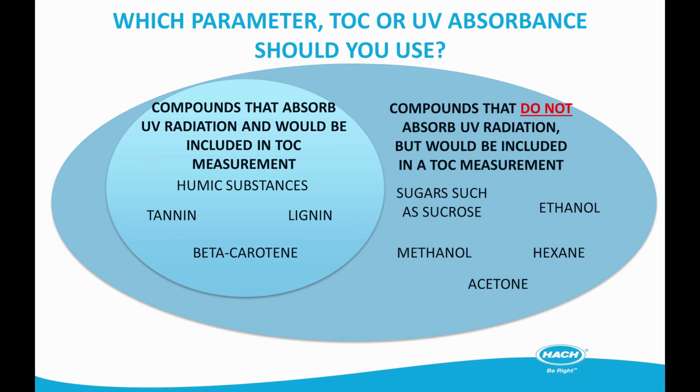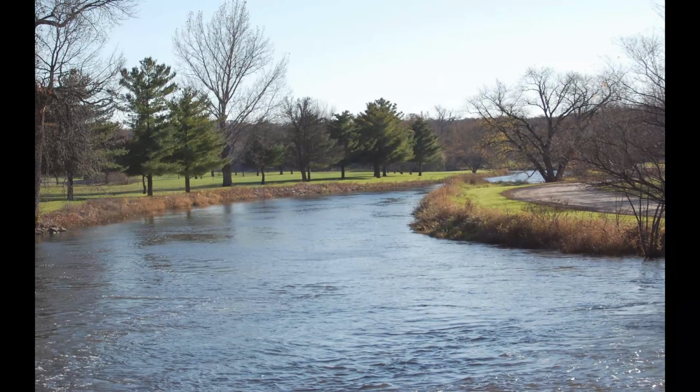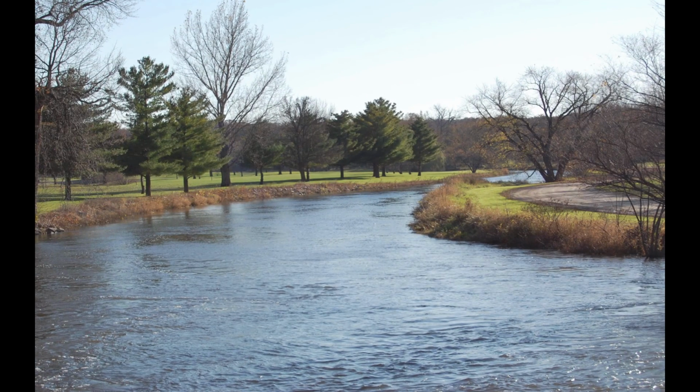UV absorption is useful for trending data, in optimization of processes, and for measuring naturally occurring organic matter present in surface waters. TOC measurements fully oxidize carbon in a sample, therefore capturing all compounds containing carbon, not just those with a double bond, allowing even more accurate disinfection dosing and process controls. Detecting, minimizing, and removing organics is critical for maintaining a high standard of drinking water.